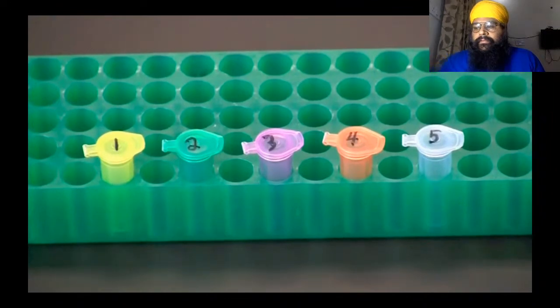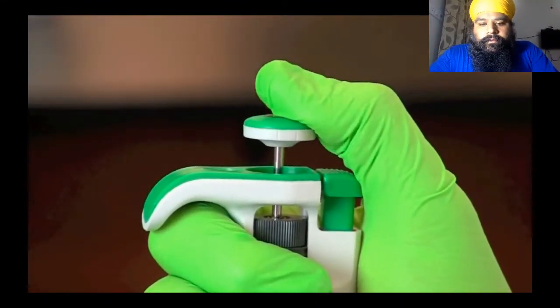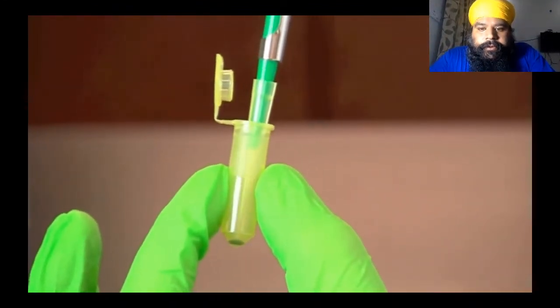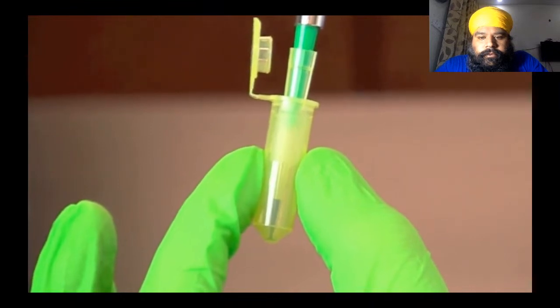Place your samples to be loaded in the correct order according to the lanes they are assigned to be run in. Check your lab protocol for this information. To obtain a DNA sample, slowly depress the plunger on your adjustable micropipette to the first or soft stop. Holding the plunger down, insert the tip of the pipette into the microtube with the DNA sample. Place the tip close to the bottom of the sample, then slowly release the plunger button.